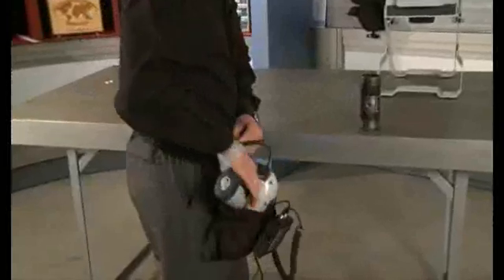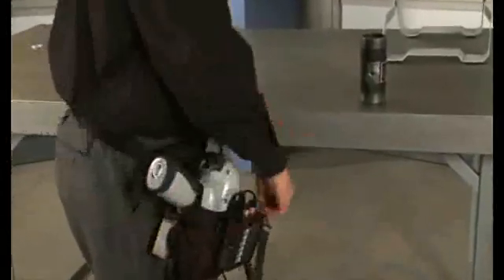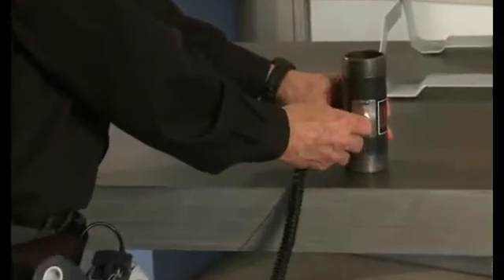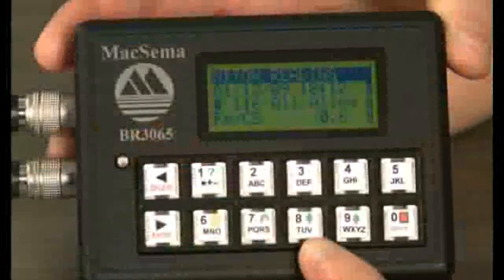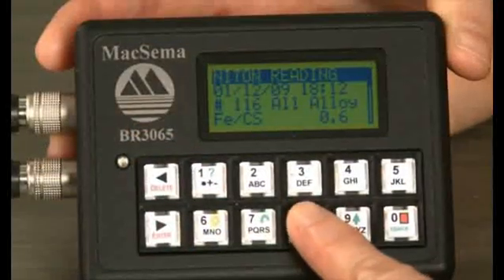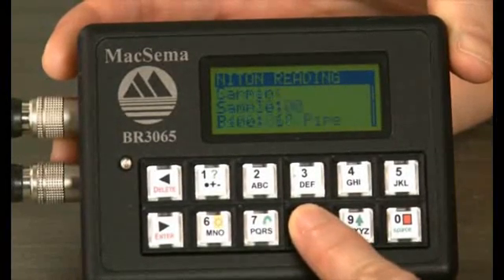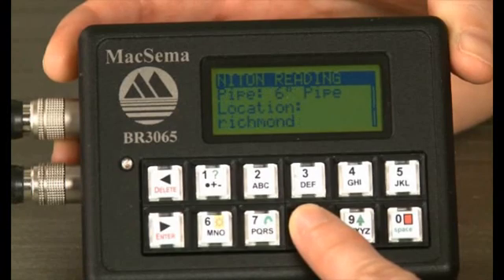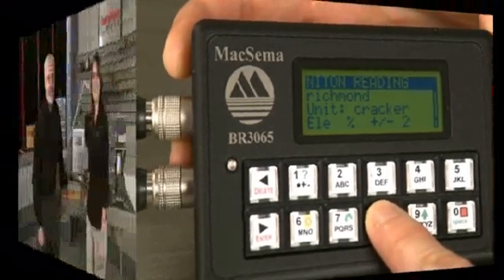A retractable lanyard makes the fingertip button probe easily accessible. Simply pull the fingertip probe and touch the button. The compressed data will automatically be written to the button. A good beep from the button reader handheld indicates all went well. For more information on the EPI system, contact your local Thermo Scientific Niton Analyzers sales representative.